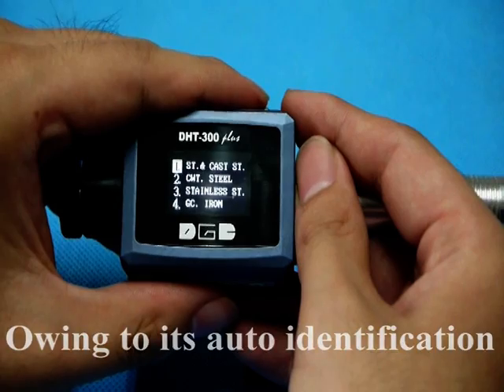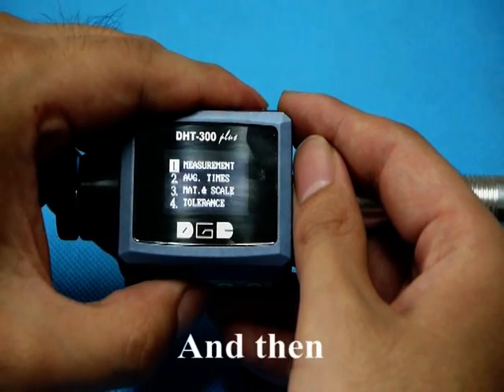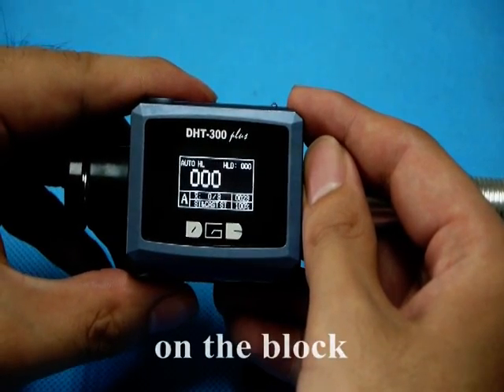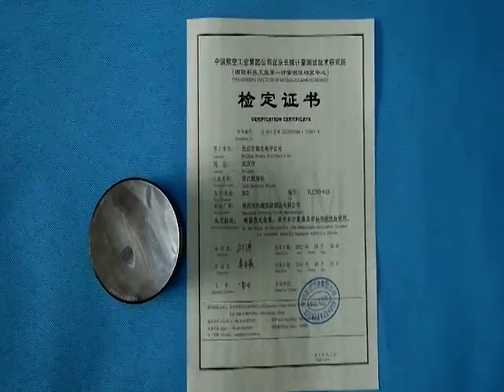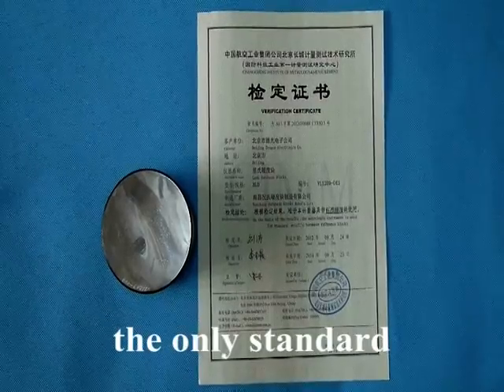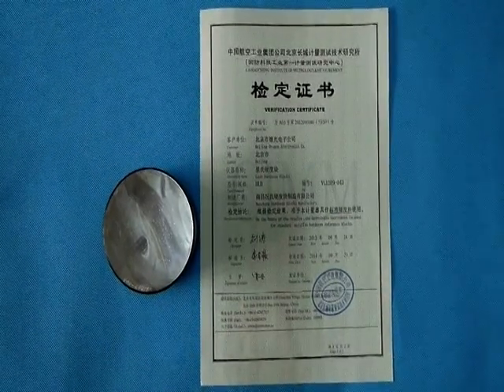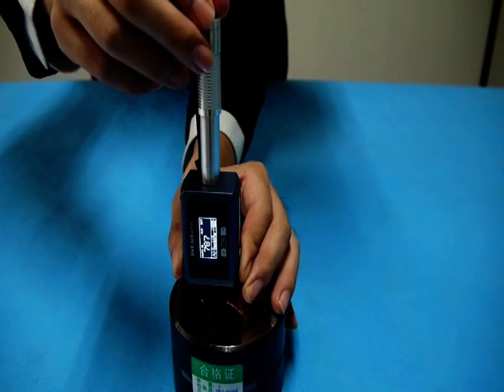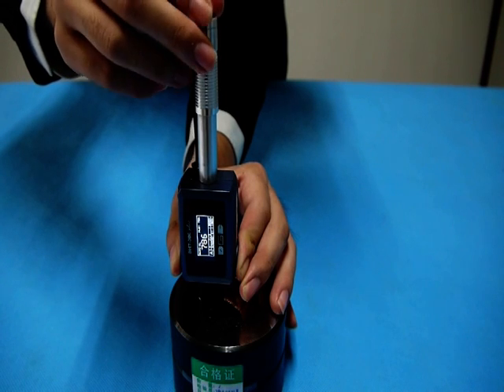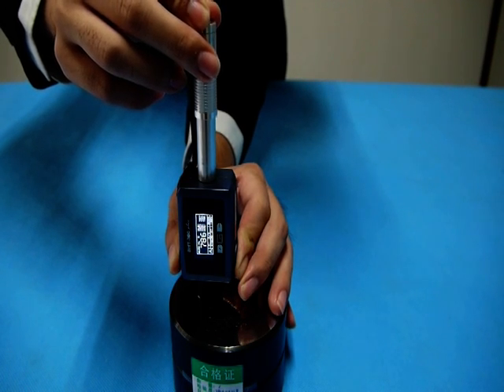Owing to its automatic identification of impact direction, the basic setting is accomplished, and then you can make tests on the block. Due to the importance of the test block as the only standard of harness value, we attach a certificate for each test block. The process is load and release — repeat another two times.